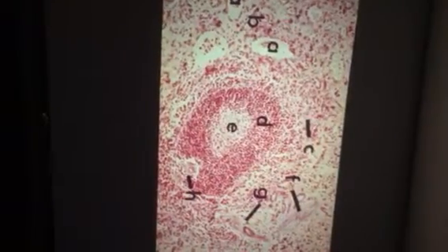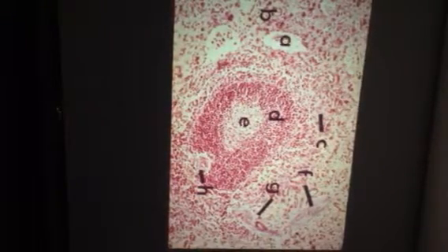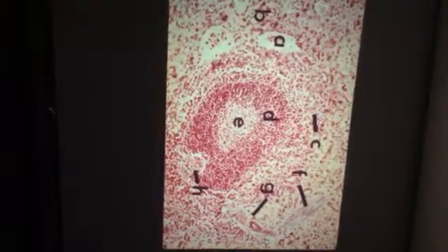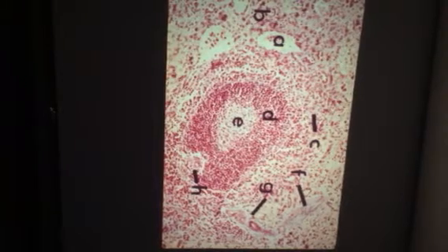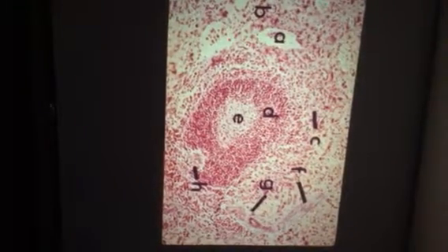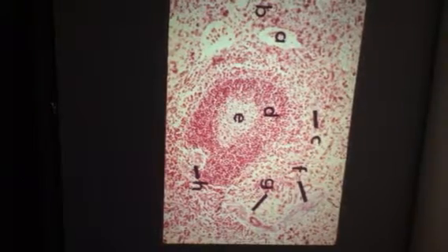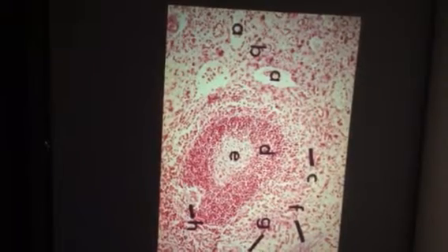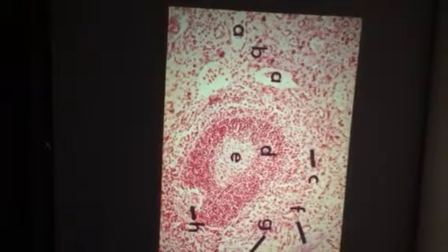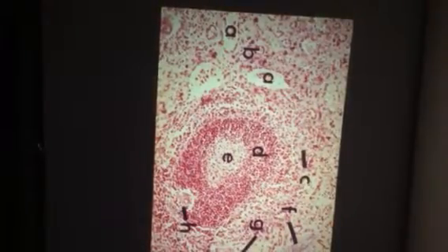Okay, well this right here is that white pulp, and right there, what is that structure right there? Central artery, and immediately surrounding that is what? Aha! Periarterial lymphatic sheath. Well, what is this structure hanging from that, more or less? It's a lymphatic nodule, but specifically that's called what? Splenic nodule. And that structure right there and right there, what are those? Splenic sinuses or venous sinuses. And there's another one right there, and in between those two we would have what? Splenic cord or Billroth's cord. So this tissue out here, or this pulp out here, is what? Red pulp.